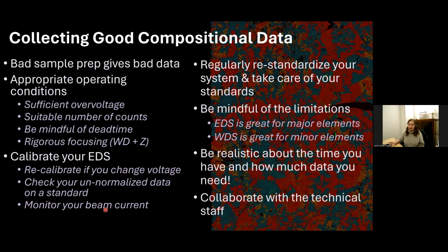Make sure you regularly re-standardize your system. If you are running standardized EDS, you don't have to standardize every time you do your analysis. The software will store those, but make sure you do them every now and again. So I try and get them done sort of every 6 months or so, once a year at the very least. And that means that it can accommodate basically for any instrument drift that's occurring.